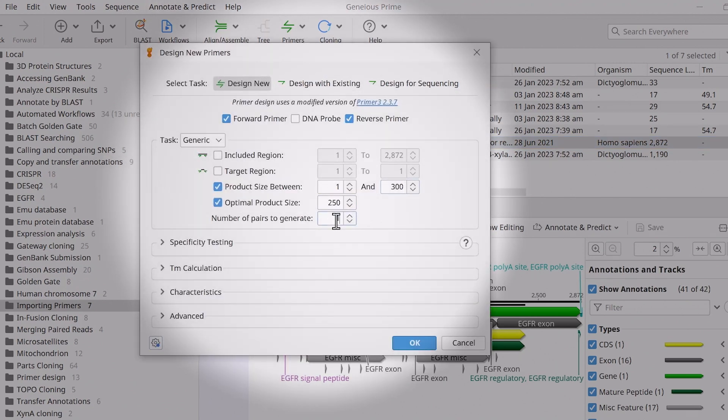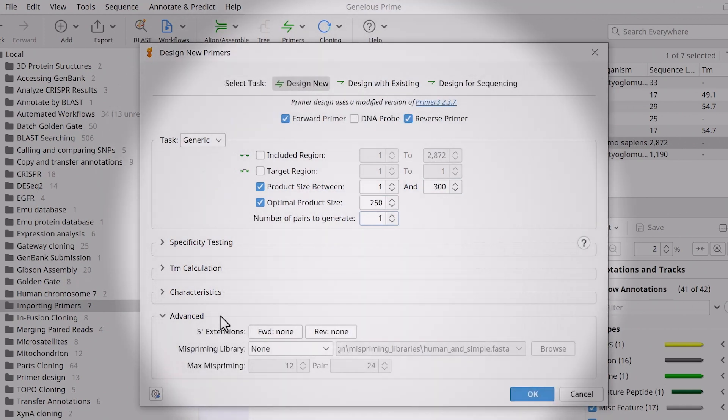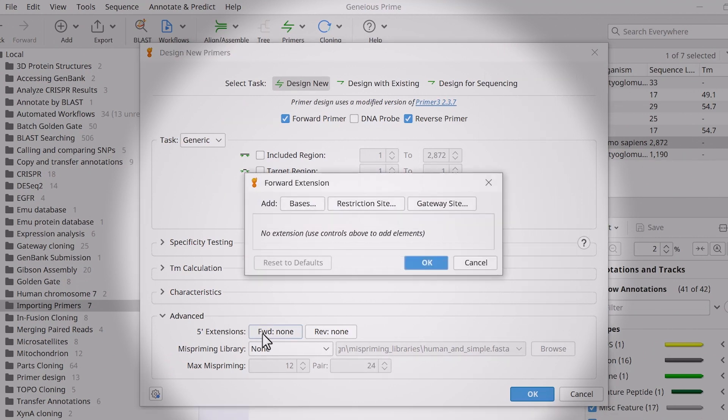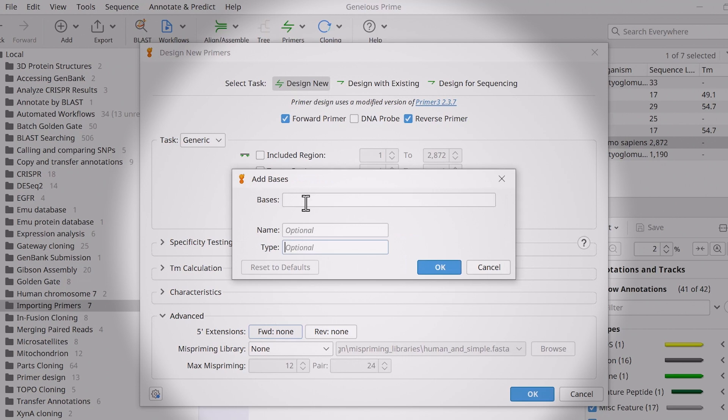To add a five prime extension, open the Advanced Settings. You can add an extension to the forward and/or reverse primer by selecting an option. As before, add custom bases, restriction sites or a gateway site. I will add some custom bases in this example.